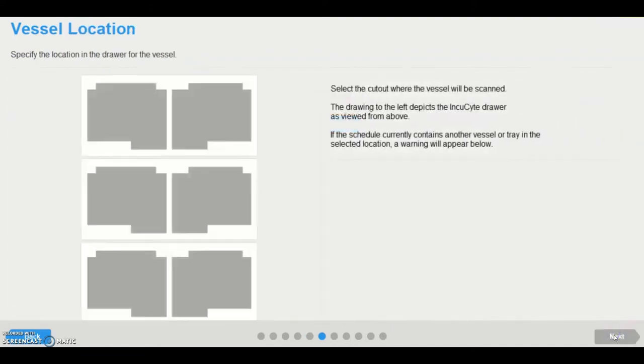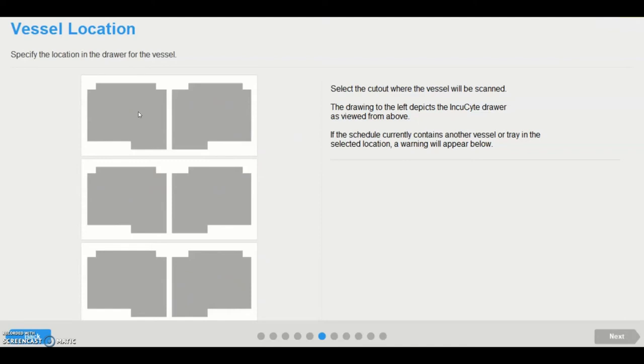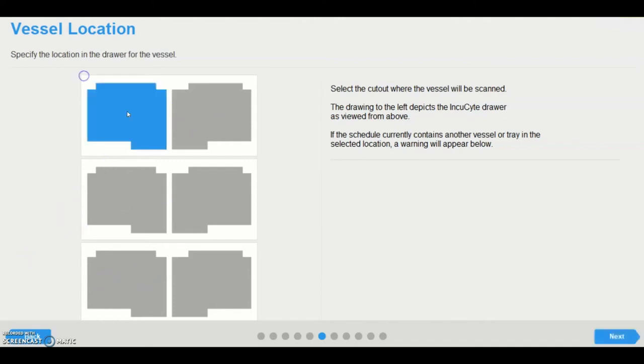In the vessel location page, users can select a position in the Incusite where their vessel is located. Recommended best practice is to physically load the vessel into the Incusite gantry before beginning scheduling. For the Incusite S3 and S3 for Neuroscience, all three tray locations are available. Should the selected location already contain a vessel, then a warning message and table appear with the option to remove that vessel from the schedule.